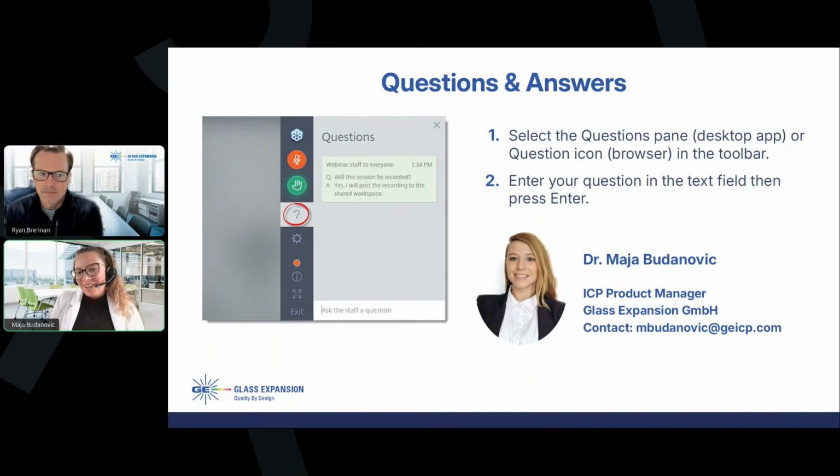Okay. So mercury is an interesting element. I actually did my PhD on mercury detection in air. It's not easy sometimes, depending on what kind of sample type you have, and whether it is ICP-MS or ICP-OES, of course, it makes a difference. But basically, I was looking into getting rid of the memory effects from mercury that sometimes can happen. There are different ways of doing so, and a lot of research has been done on that.